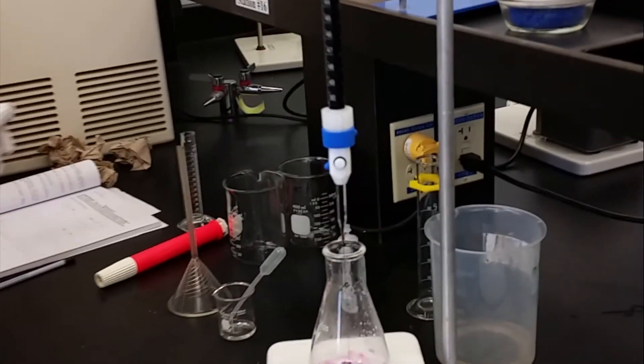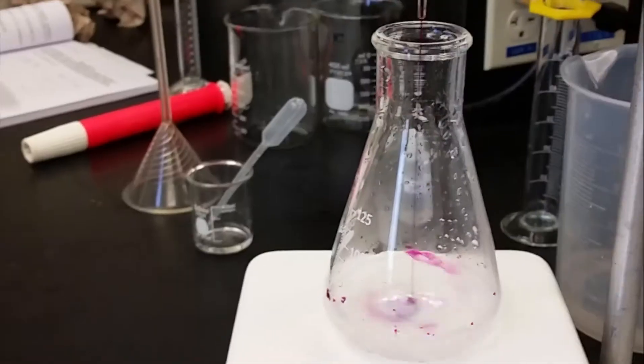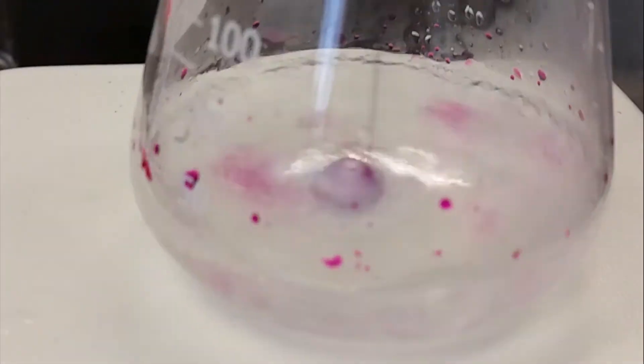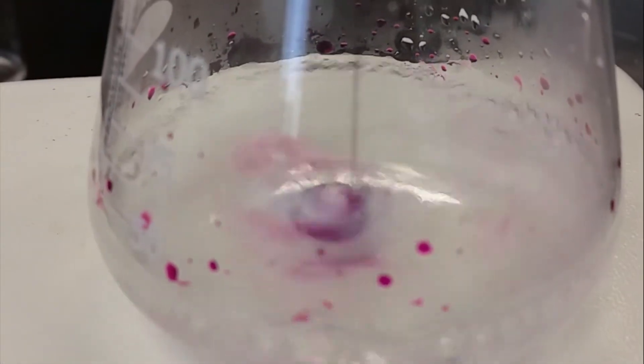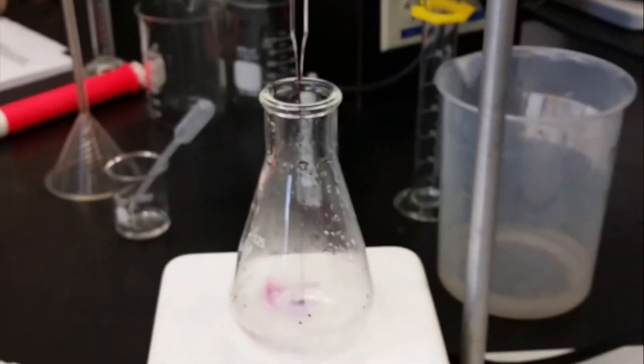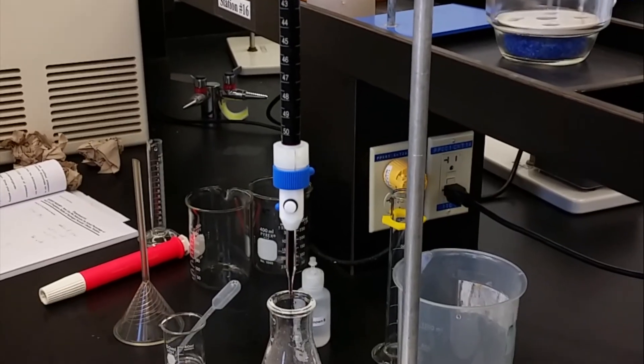As you can see, the potassium permanganate which has a dark purple color is used as a titrant and therefore it's filled in the burette. The hydrogen peroxide solution which is colorless is in the Erlenmeyer flask.